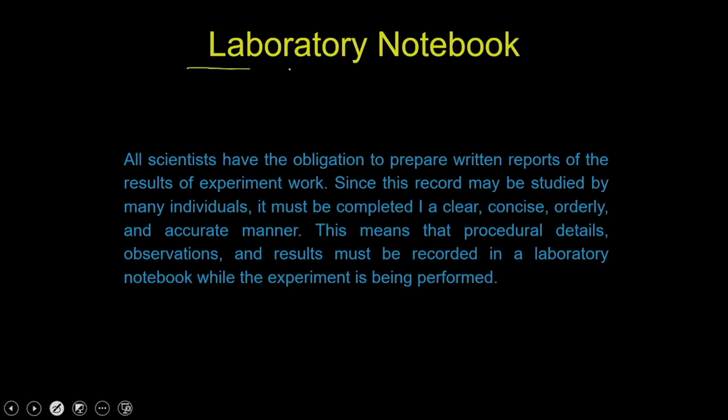Now, apart from that, good lab practices also say that besides whatever we discussed so far, the recommended as well as not recommended material, you should also maintain your laboratory notebook, which should be self-explanatory. It should have all the details required.